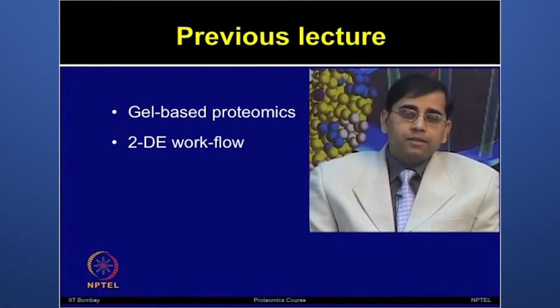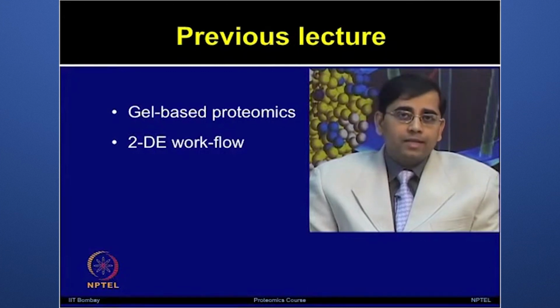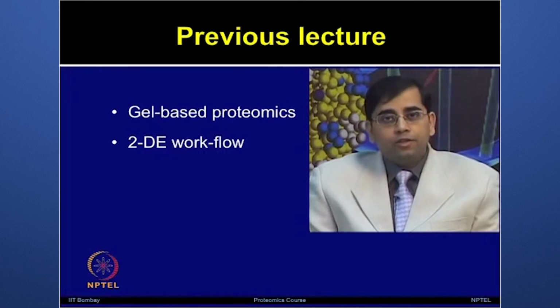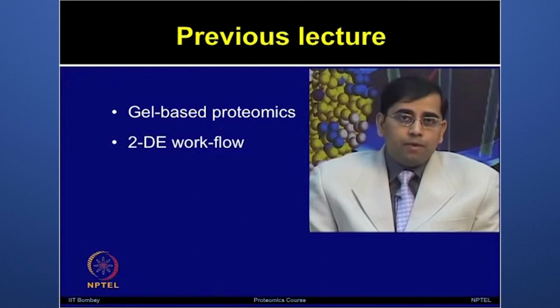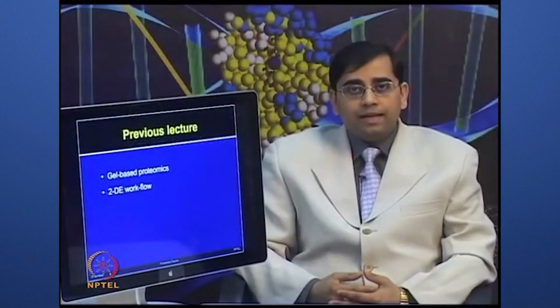We also discussed in much detail the two-dimensional electrophoresis workflow. How can you perform two-dimensional electrophoresis based experiments step by step, with various details, the nitty-gritty of performing protein extraction, different types of challenges associated with sample processing, followed by how to perform isoelectric focusing and then how to do SDS-PAGE analysis.